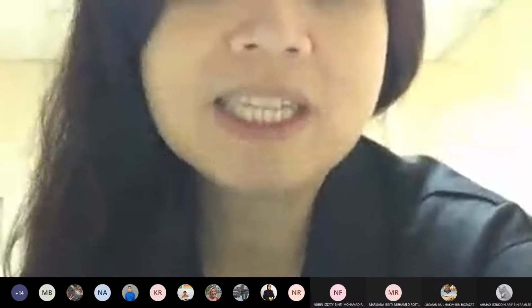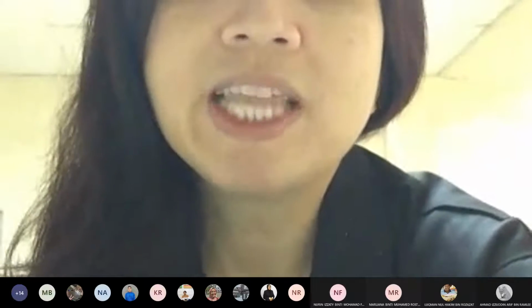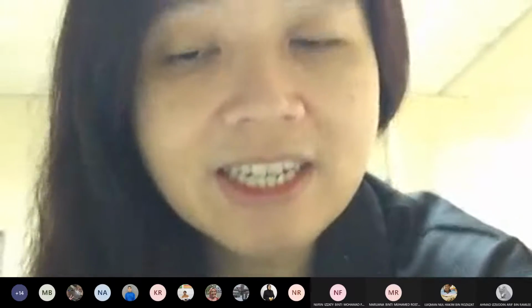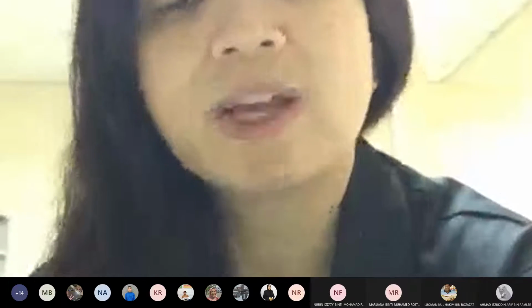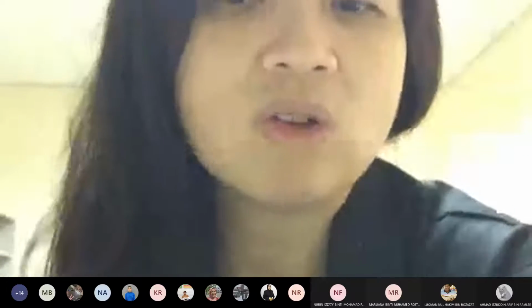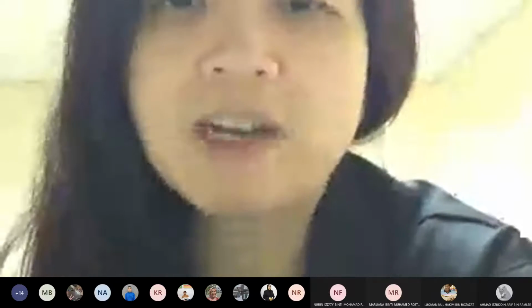What is important for me personally, even if you don't come back for the lab, is that you understand what reactors are, okay, what's the basic configuration, the system, the parts, the important parts, and so on and so forth. Okay, so it will take only about 1.5 hours. So I will explain all 4 experiments for you.